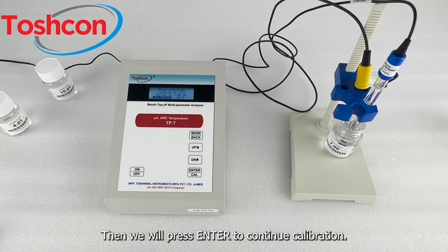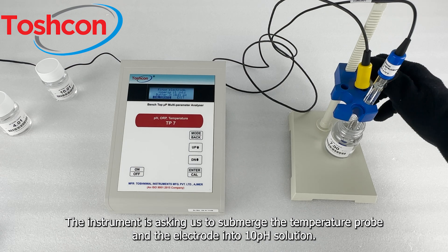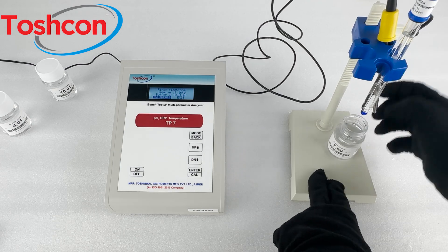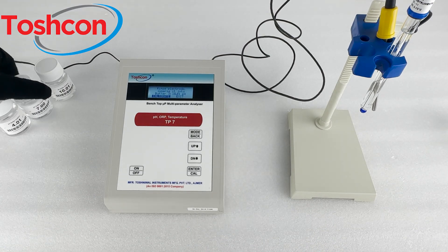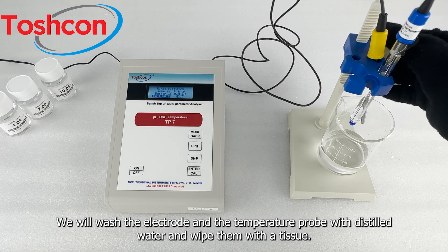Then we will press enter to continue calibration. The instrument is asking us to submerge the temperature probe and the electrode into the 10 pH solution. We will wash the electrode and the temperature probe with distilled water and wipe them with a tissue.